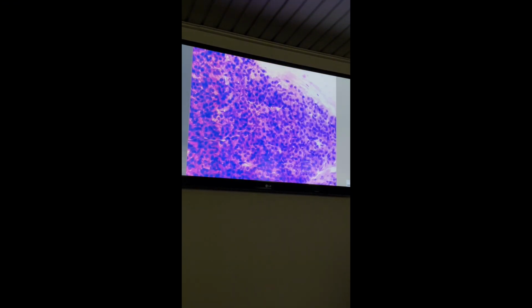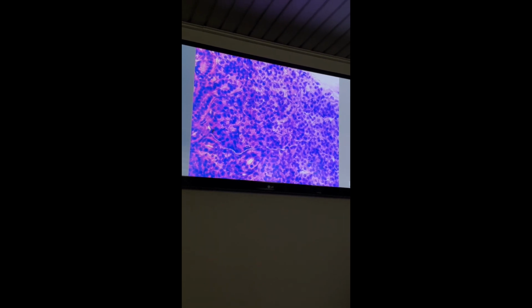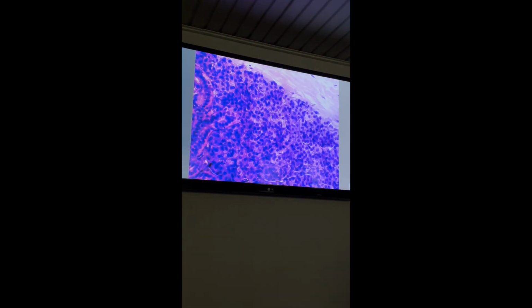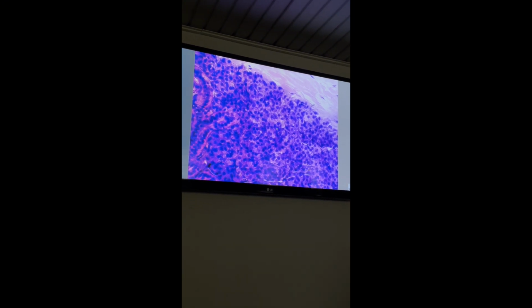Which type of duct? Striated duct. What about this structure?